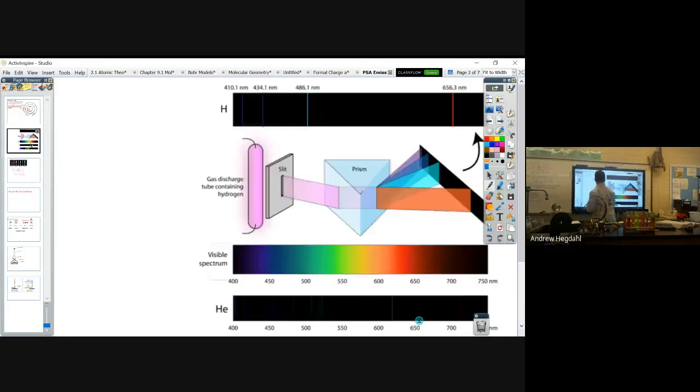And Maddie, this is kind of what's happening here. We've got these spectroscopes, light passes through here, and then inside of them, they see these bands of colors. Okay? All right. So did you all get a good view of that?